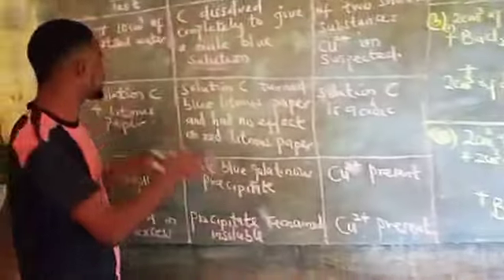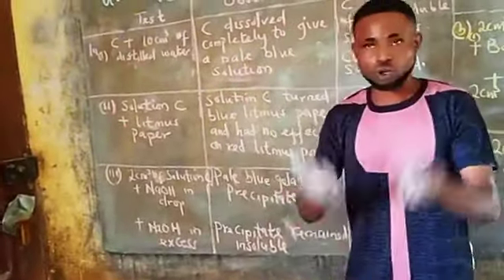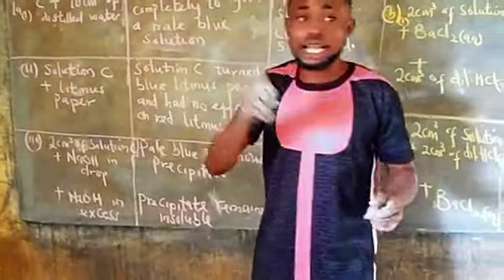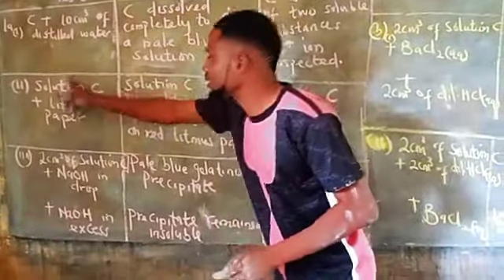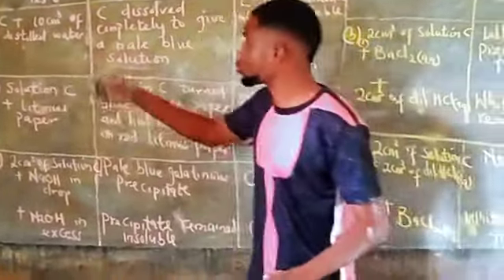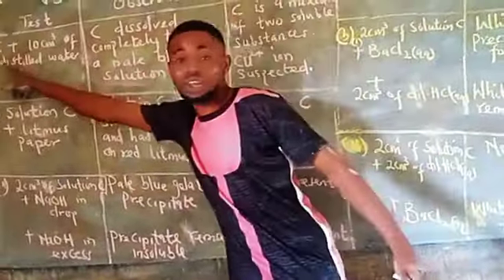So far, we have mixed the two together, and we now call this a solution. It has become solution, not C again, please, not solid again. Students normally make a mistake here by putting C. It has become solution because you already added the water to it. Some students can write solution C, while some students can write C aqueous.